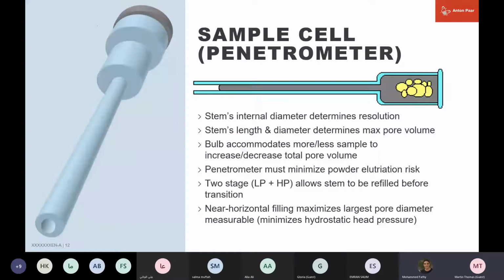With a mind to using liquid mercury, if you're using this technique, if you can minimize the amount of mercury that's used, then that's good for operating costs and obviously good for the environment. There's less mercury that has to go into the recycle system. We never blindly dispose of mercury. It has to go into a recycle route, and then it's redistilled and you buy it back fresh. We always want to use fresh mercury for these measurements to get high quality analysis.